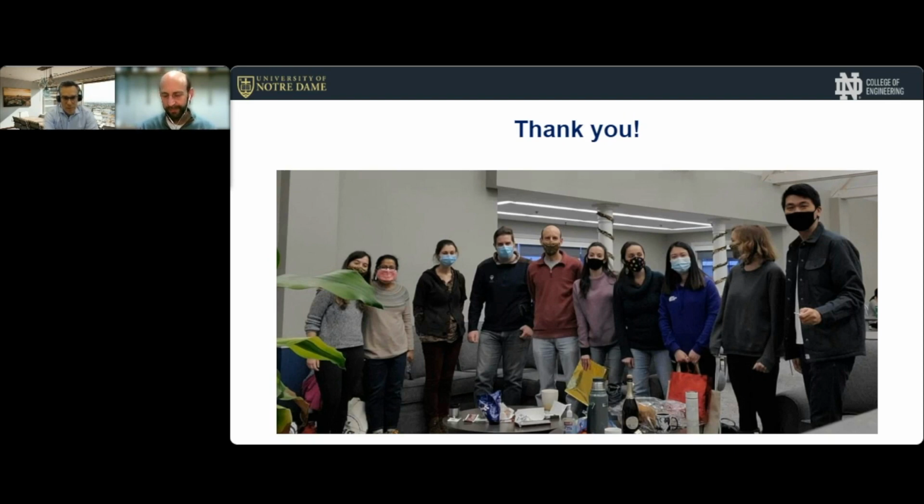Dear Professor Robert, we are a group from the Department of Chemical Engineering at Khalifa University in the United Arab Emirates. We observed scaling using OCT. We also observed the voids, so the space between the membrane and the scaling, as you see in the case of biofilm. What do you think could be the reason for the voids in your case? Thank you.